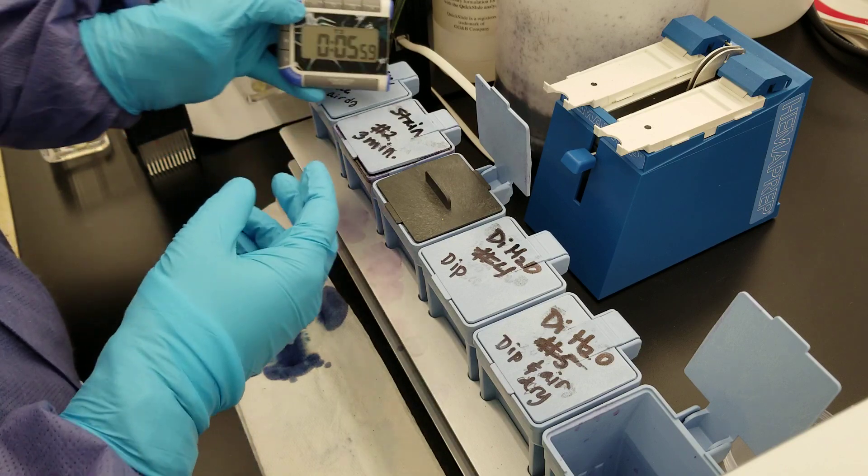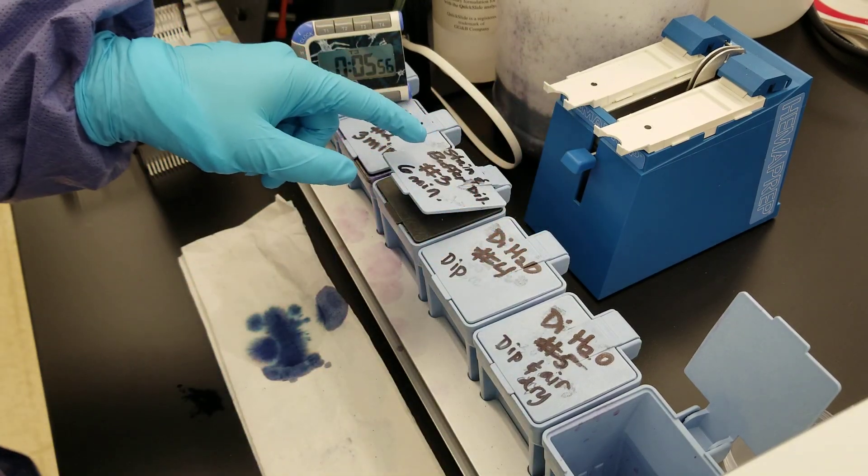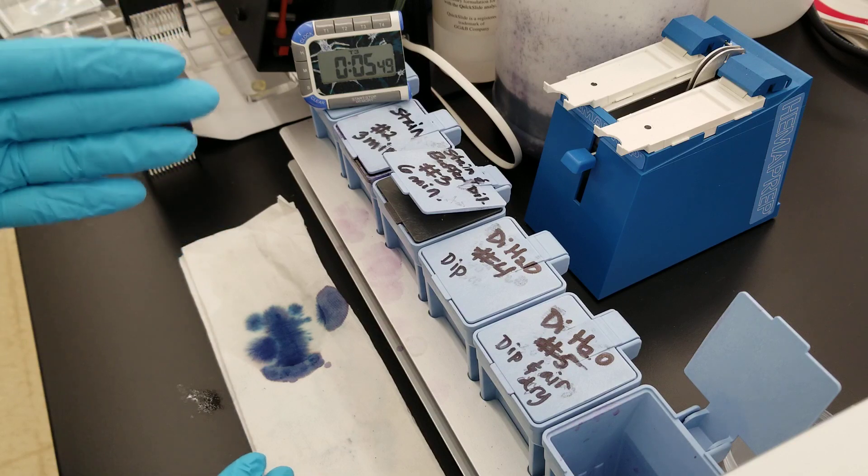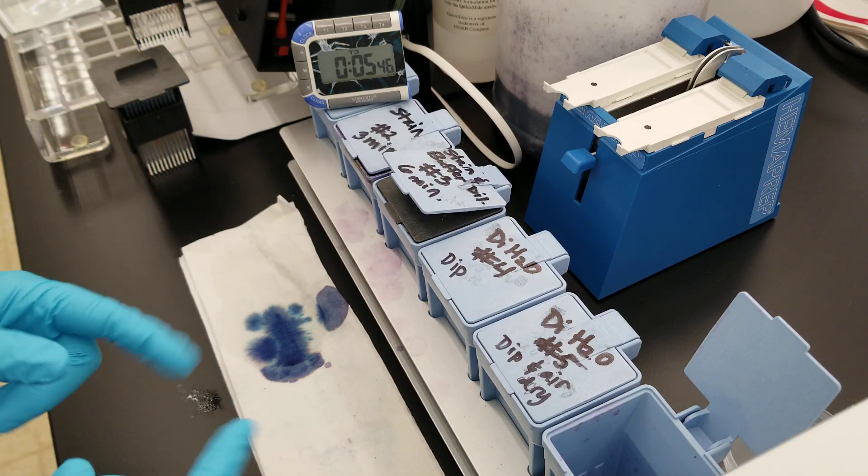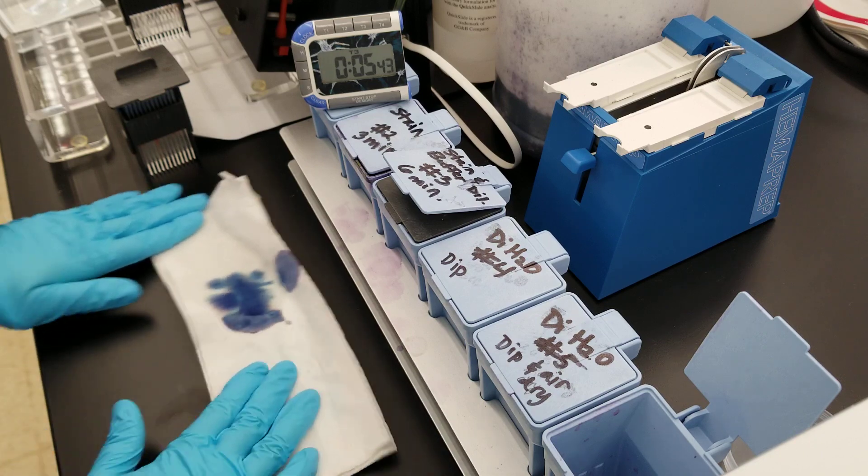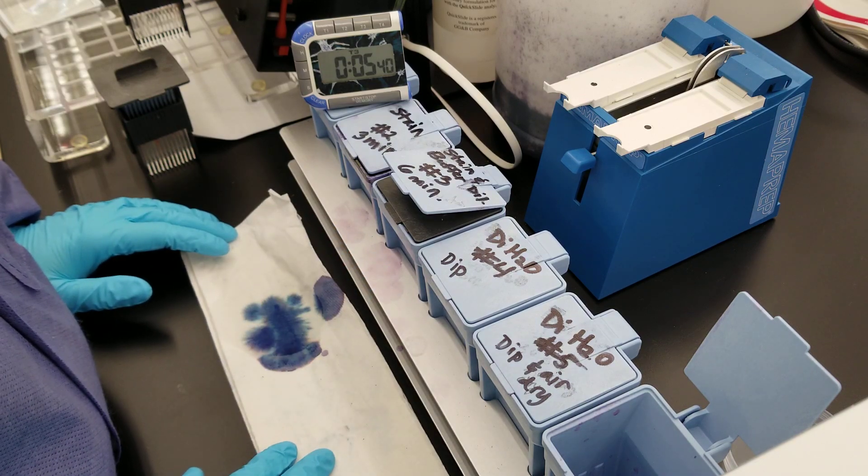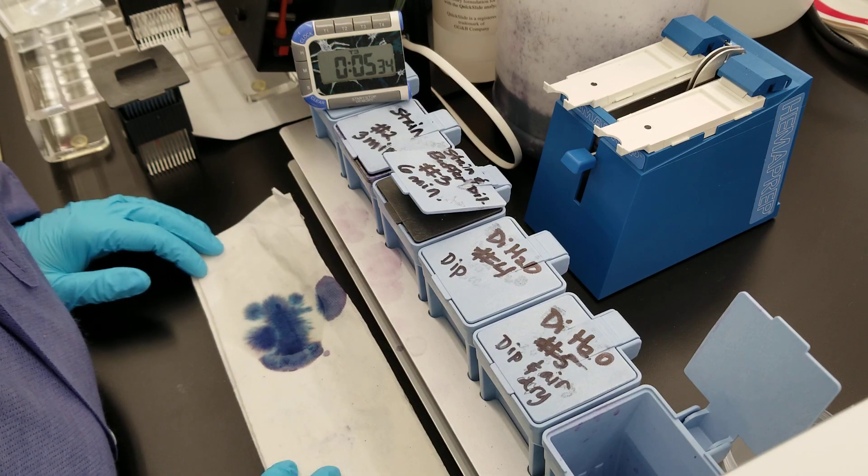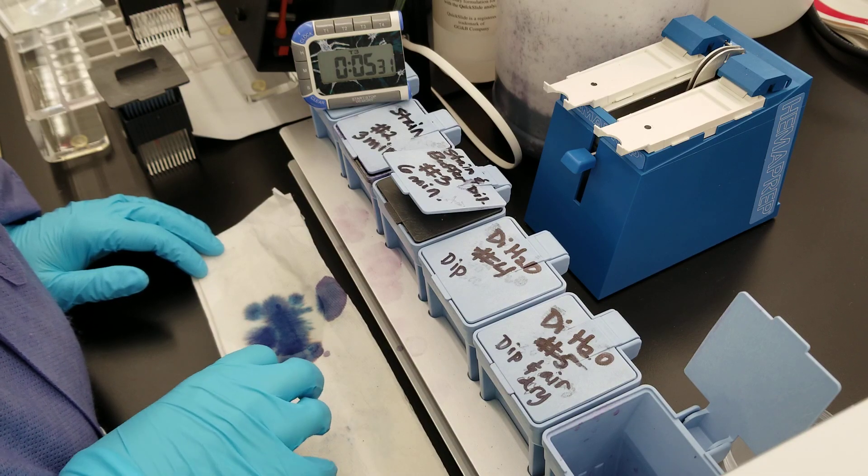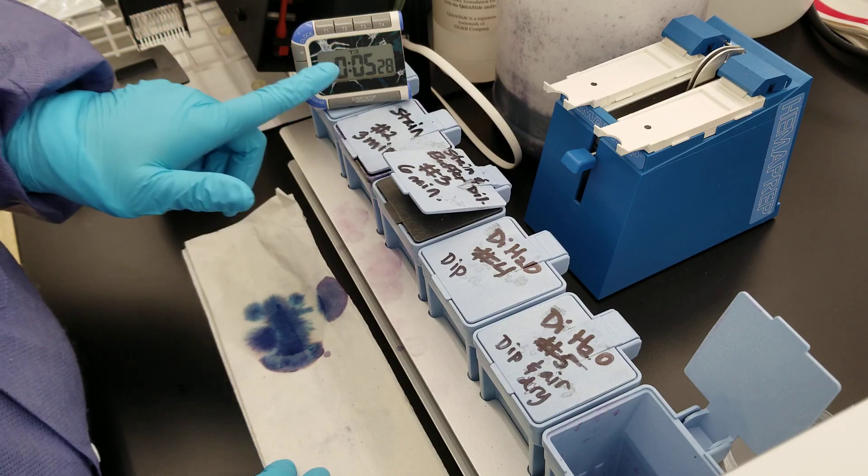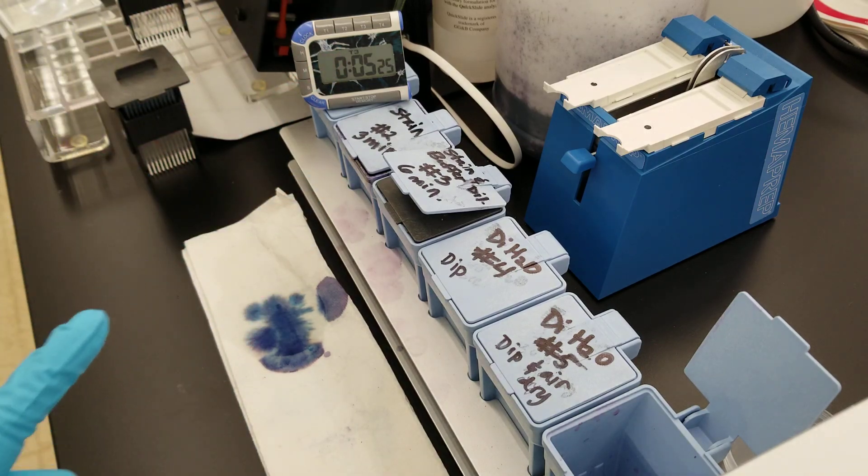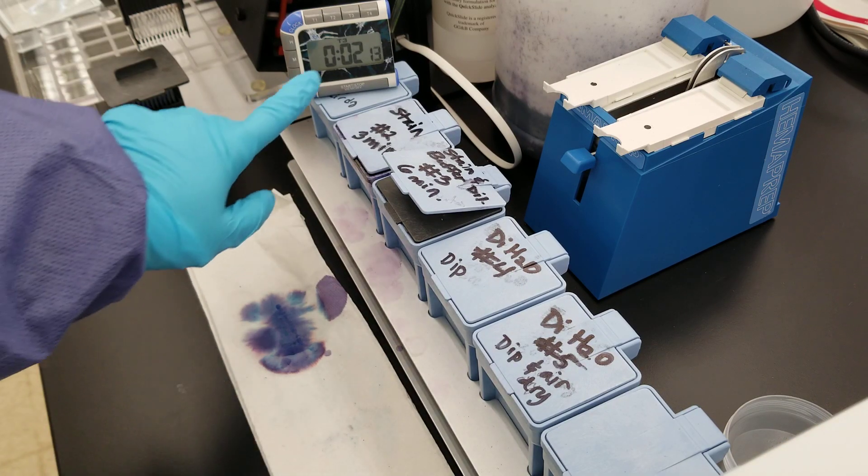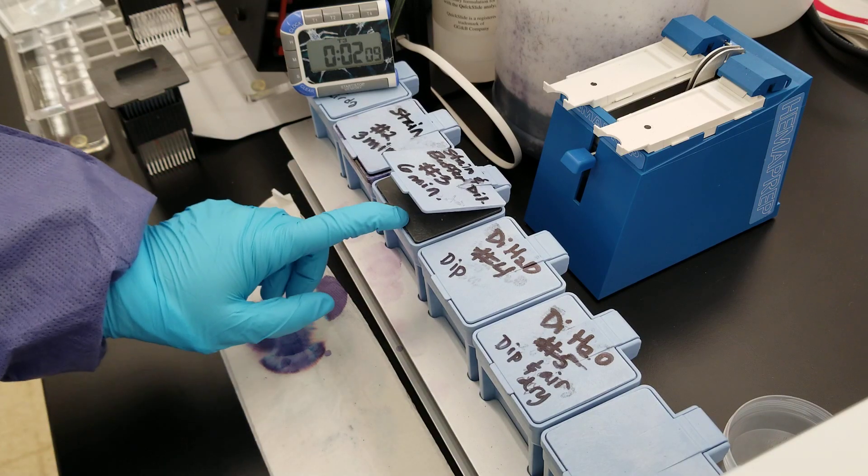And press start. This is the stain and buffer diluent together. A buffer keeps your solution in a pH range that is desired. That's what's happening here. We're keeping it in the desired pH to make sure the cells are appropriately taking up the stain to wherever it is, whether it's the cytoplasm or the nucleus. This is six minutes. I'm not going to sit here and have you watch six minutes, so I'll pause it and be back.